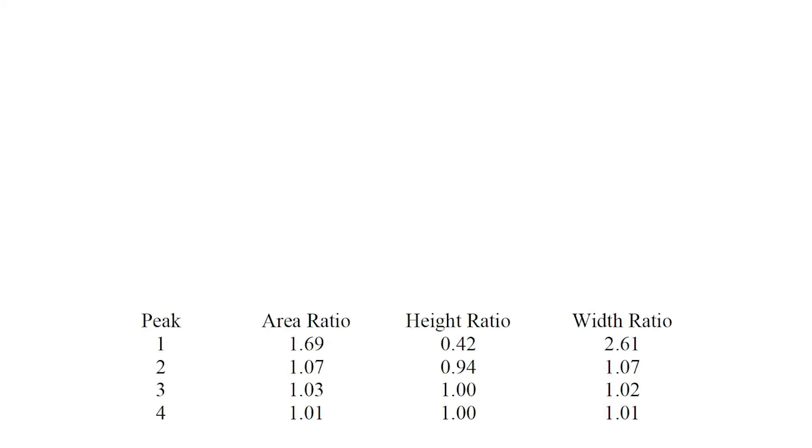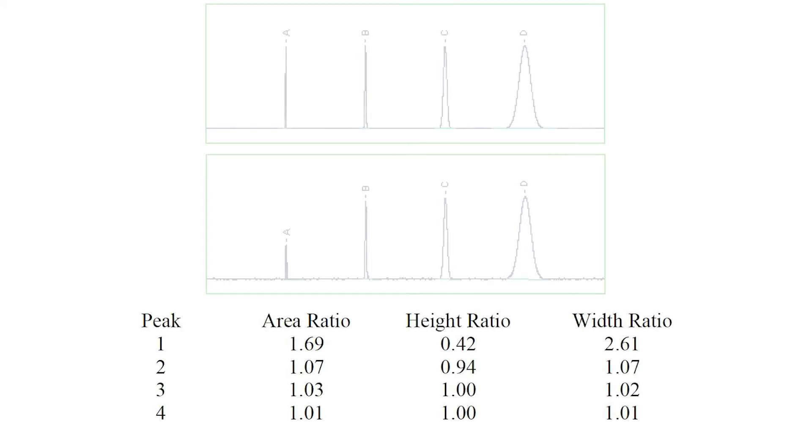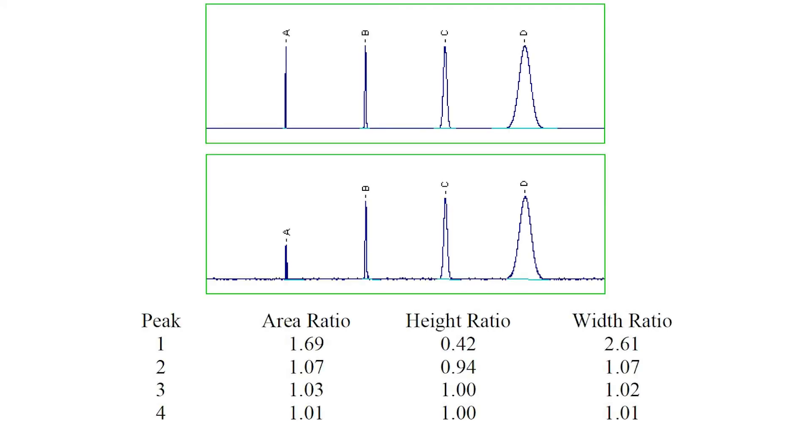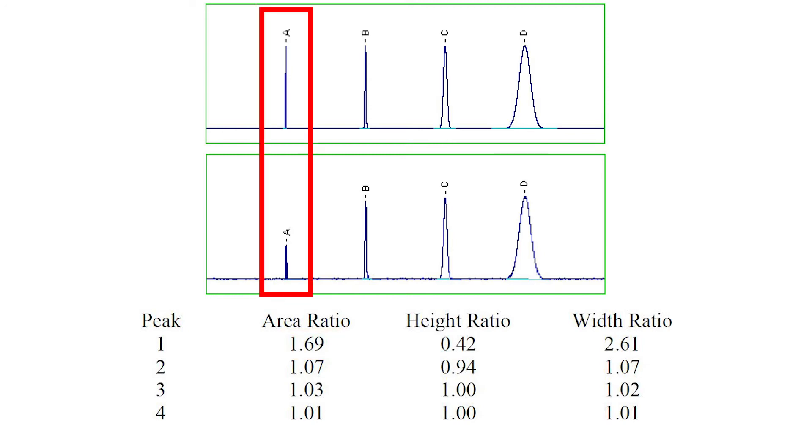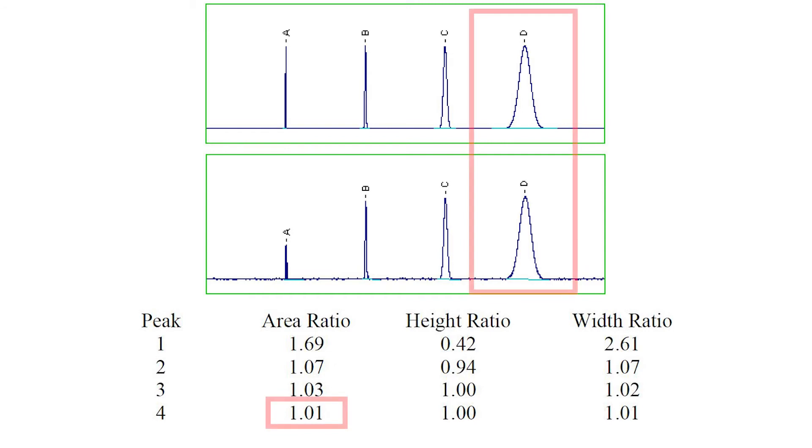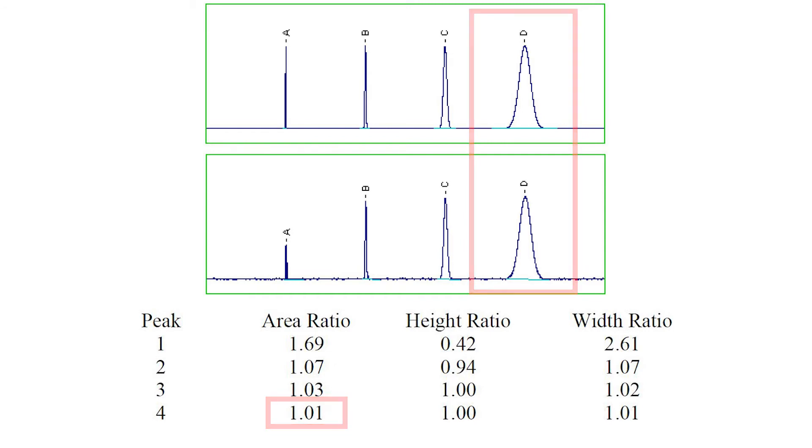This table now compares the upper and lower traces. Note that smoothing has improved the accuracy of the calculated peak areas. The excess area for the narrowest peak has been halved to 69%, and the improvement is even greater for the other peaks. Smoothing has also increased the width and greatly reduced the height of the first and narrowest peak, but the other peaks are less affected. The figures for the last peak differ from those in the noise-free chromatogram by only 1%.